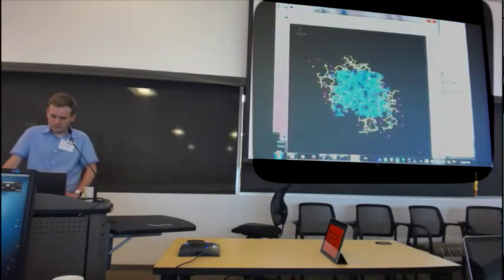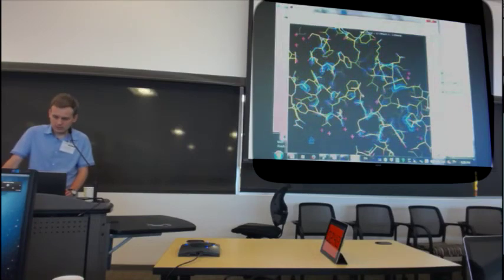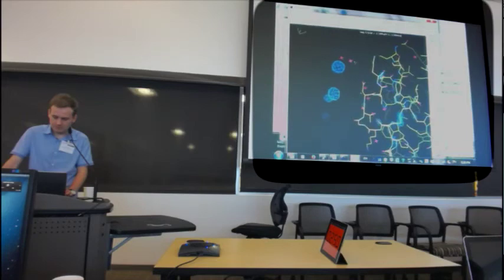So we do this. Okay, so the best density modified map. So it's this one. So let's try to find the gadolinium sites. Scrolling down. Oh, here are the gadolinium sites. And this is the final model.